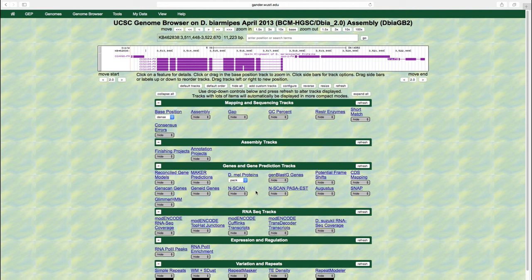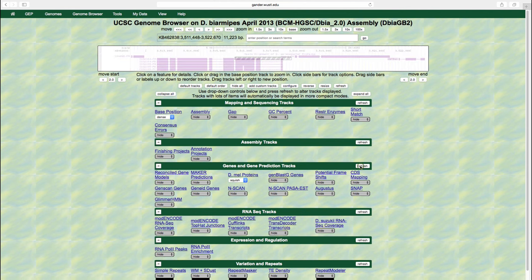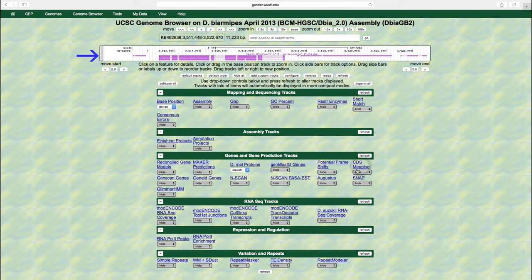The final display mode, squish, is similar to pack mode, but each feature is shown at half the height of the features in pack mode. This allows the genome browser image to show more data per inch of screen height. This display mode is particularly useful for high-density data tracks, such as displaying all of the RNA-seq reads that have been mapped to a genomic region.